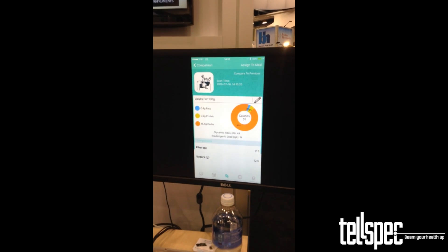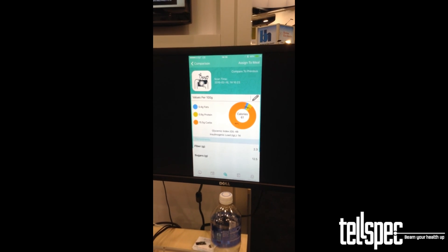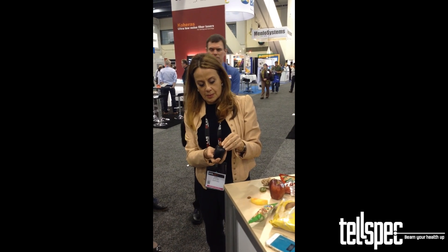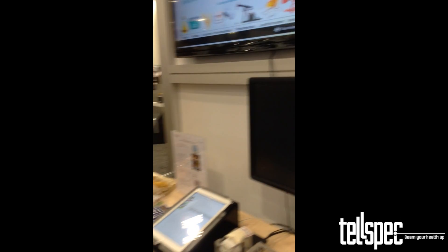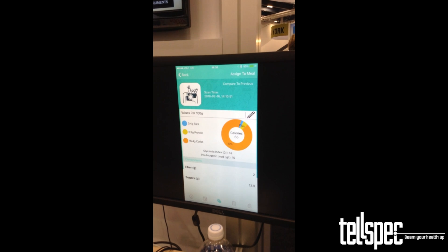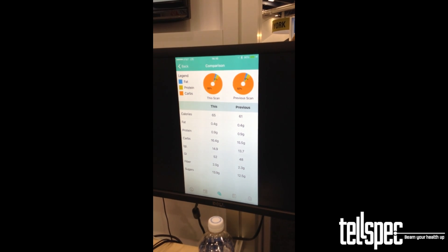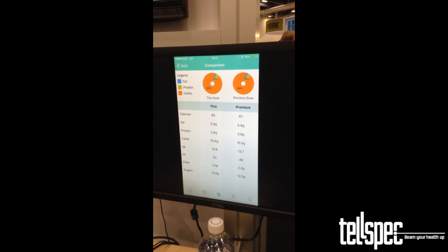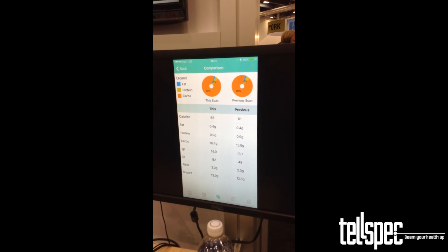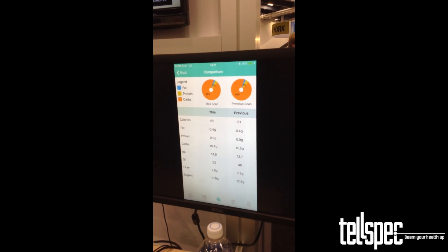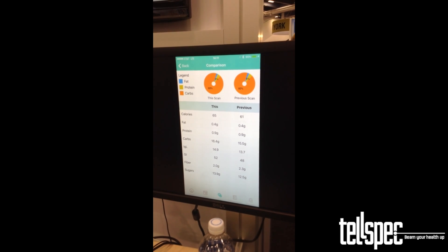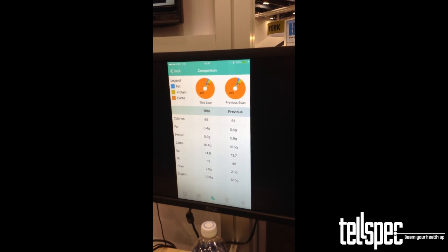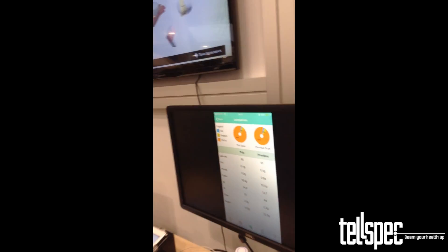Let's compare the kiwi with the grape. That's the grape — let's compare them. There's a comparison between the grape, which is the last scan, and the previous scan, the kiwi. The grape is high in carbohydrates and high in sugar, while the kiwi is low in sugar.